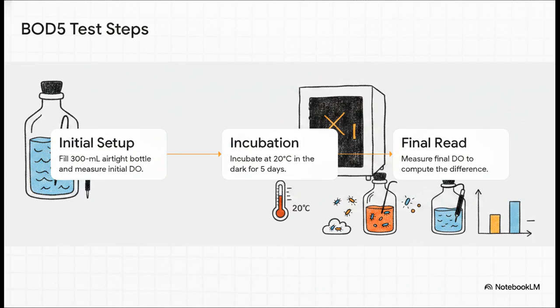Also, notice the protocol says it must be kept in the dark. This is a crucial detail. If any light gets into that bottle, algae in the water might undergo photosynthesis and actually produce oxygen, and that would totally ruin our measurement of how much oxygen is being consumed.